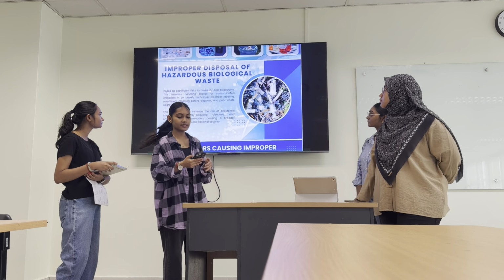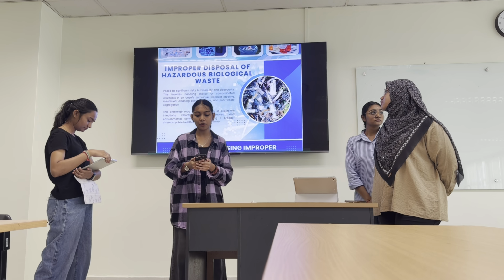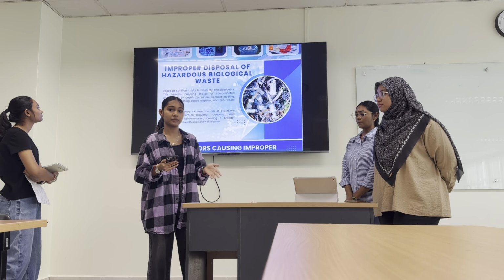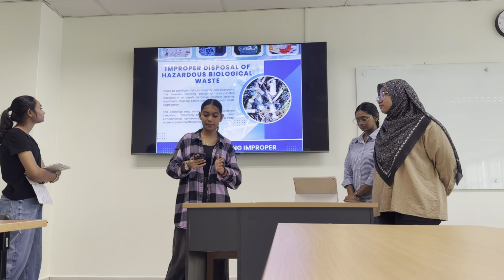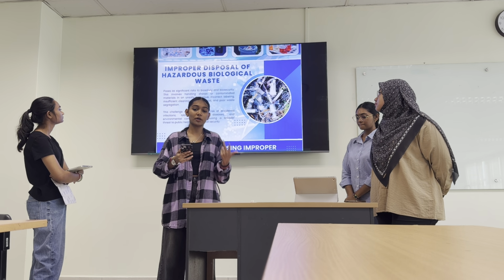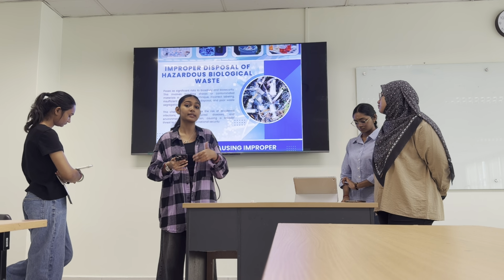Okay, so next is improper disposal of hazardous biological waste. Basically, improper disposal poses a significant risk to biosafety and also biosecurity within laboratory settings. This issue occurs when sharp contaminated materials or infectious samples are handled and discarded incorrectly.